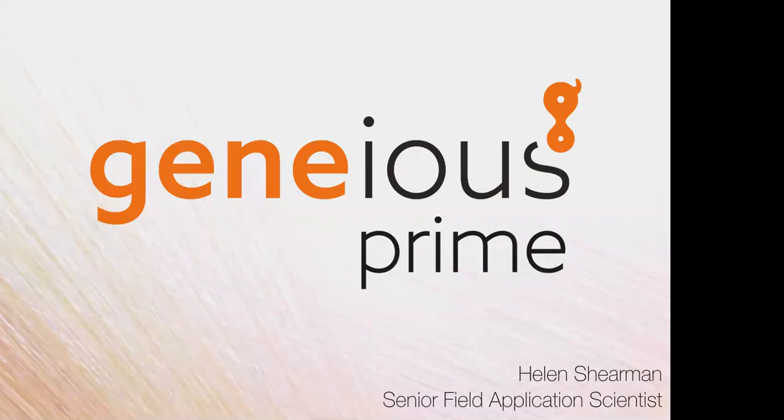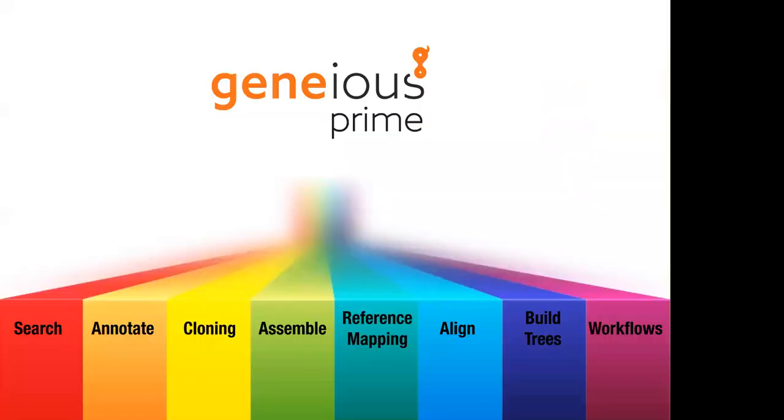So with that, like I said, just a couple of slides to start out with. And the first thing is sort of what Geneious does, because there's a lot of different tools, a lot of different analyses you can do, all from within this one piece of software.